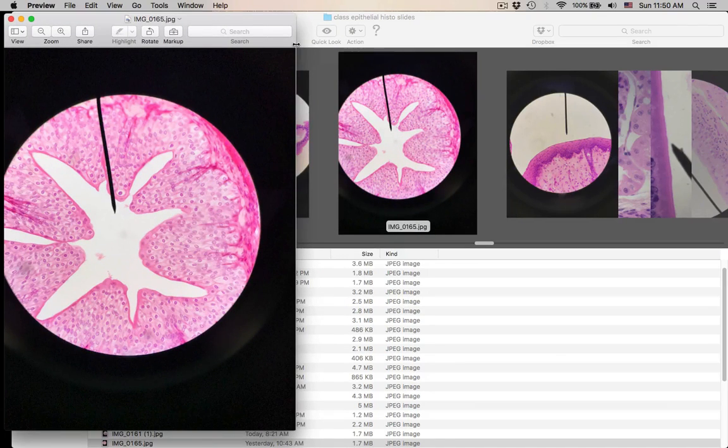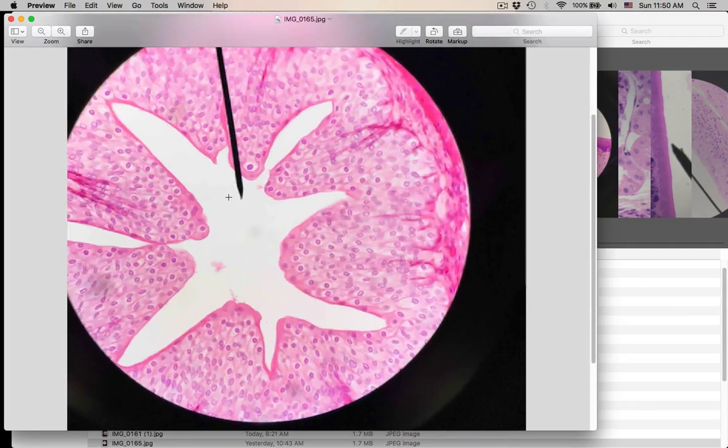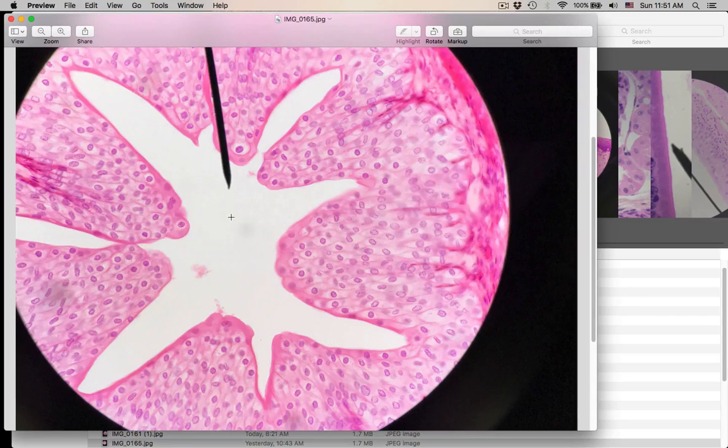Pointer in the lumen. What type of epithelium? You know that's transitional. No doubt about it. Look at those apical cells. Transitional, where do you find it? In the bladder and ureters. U-R-E-T-E-R-S, ureters, the tubes that carry urine into the bladder. Transitional, it's stratified, yes, but look at those apical cells. These are dome-shaped, weird-looking cells up here. Transitional. So that was number 20.